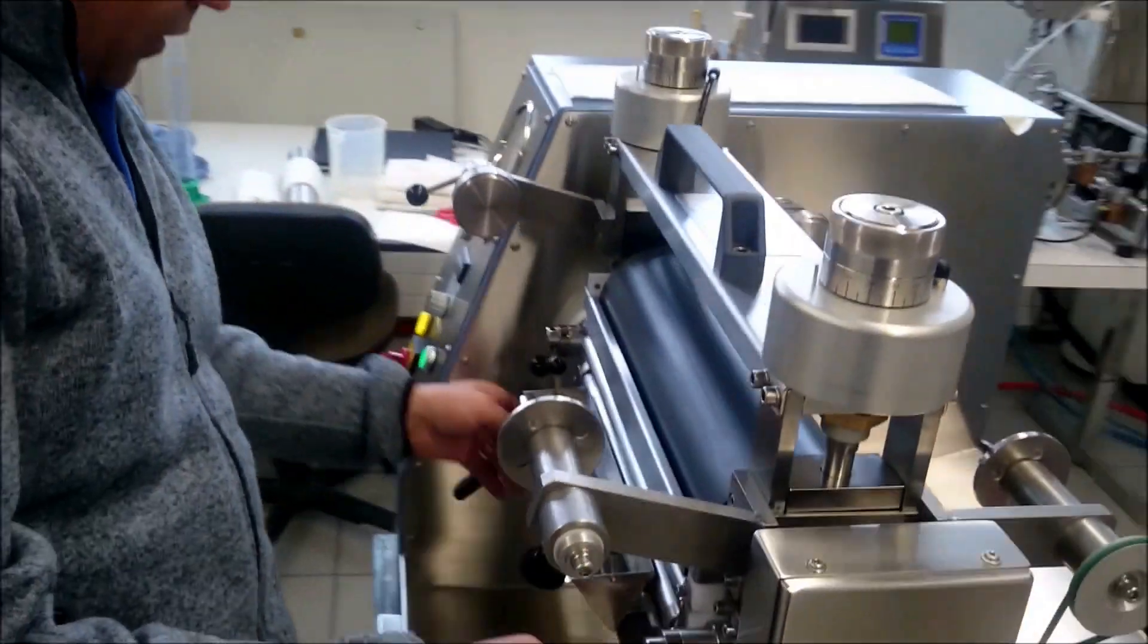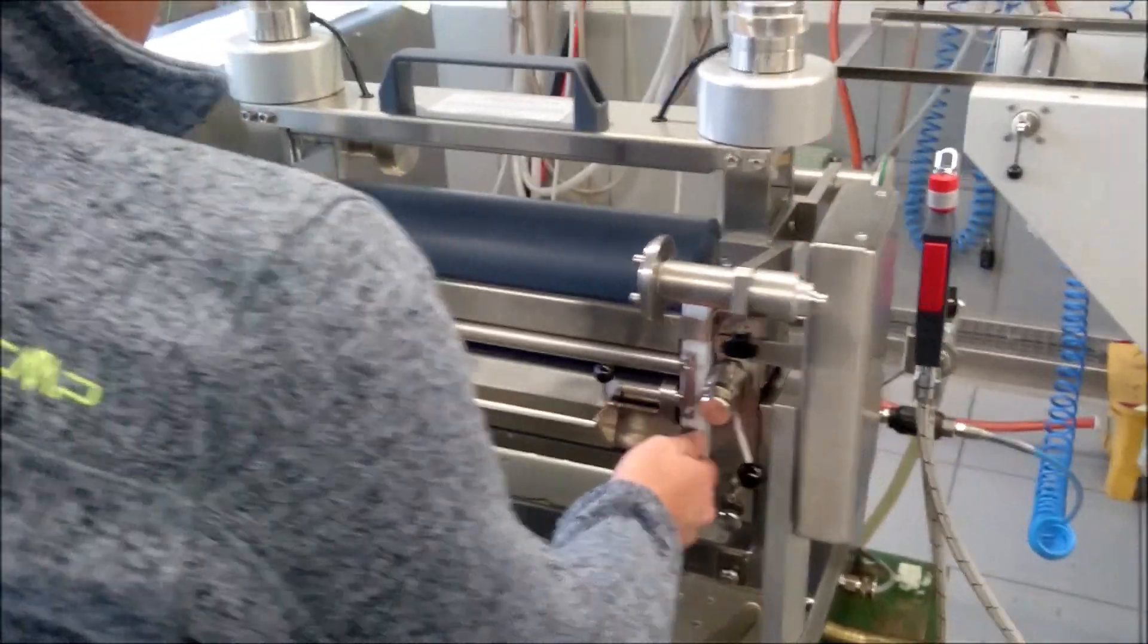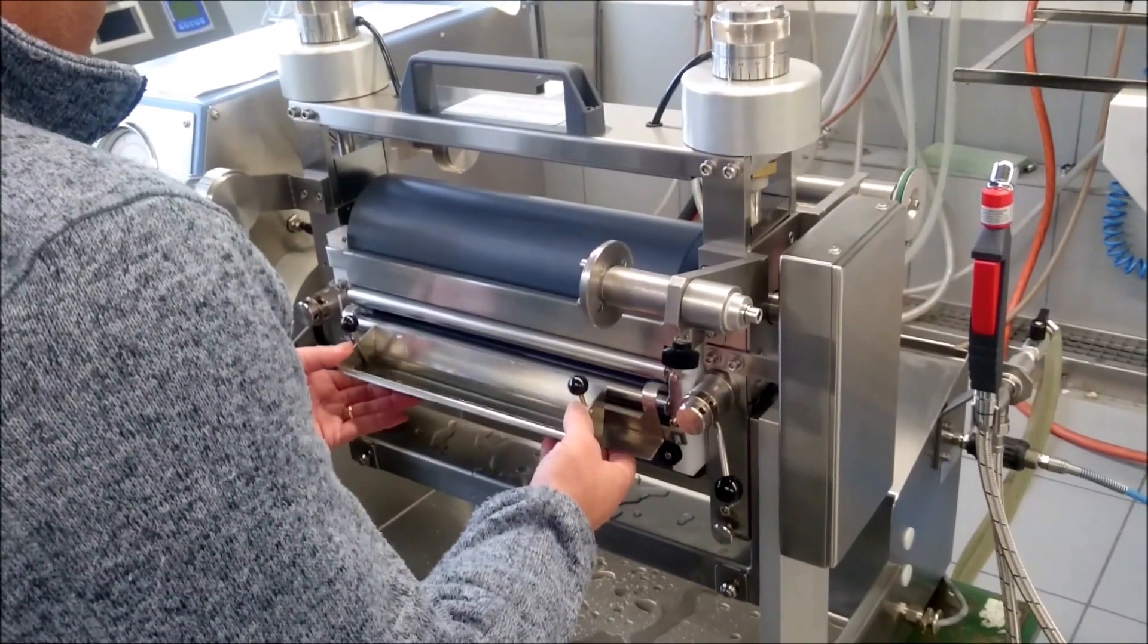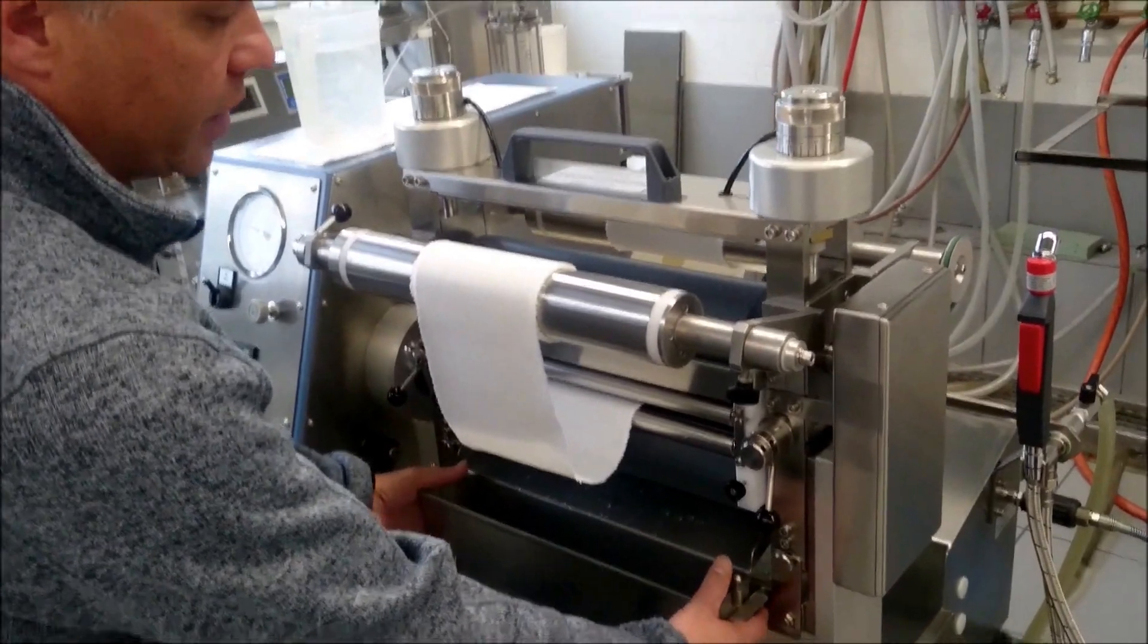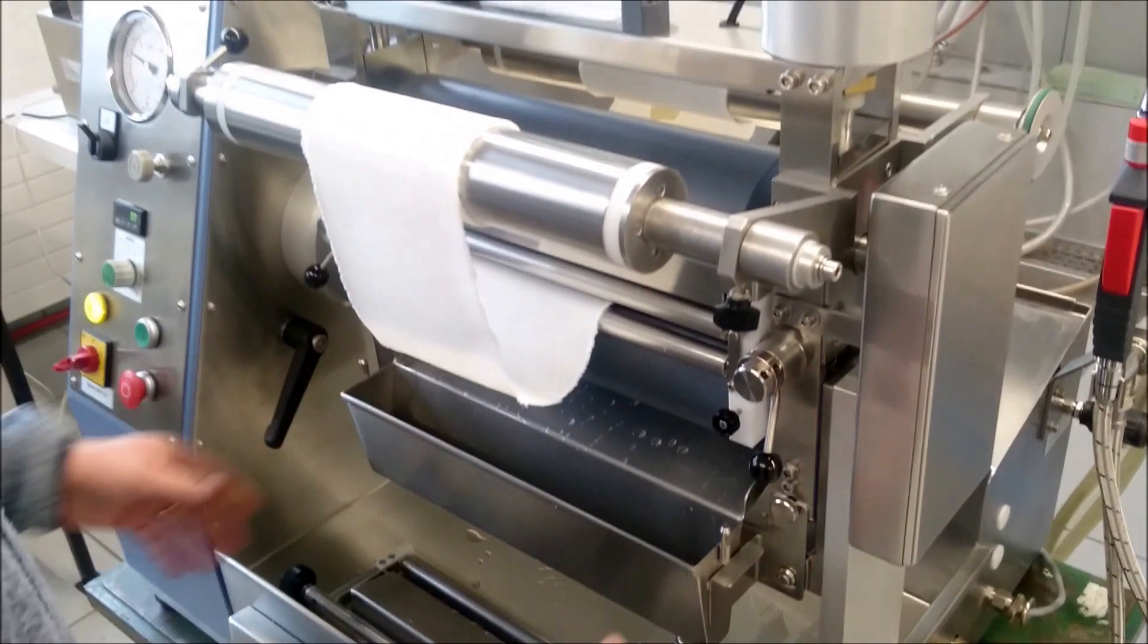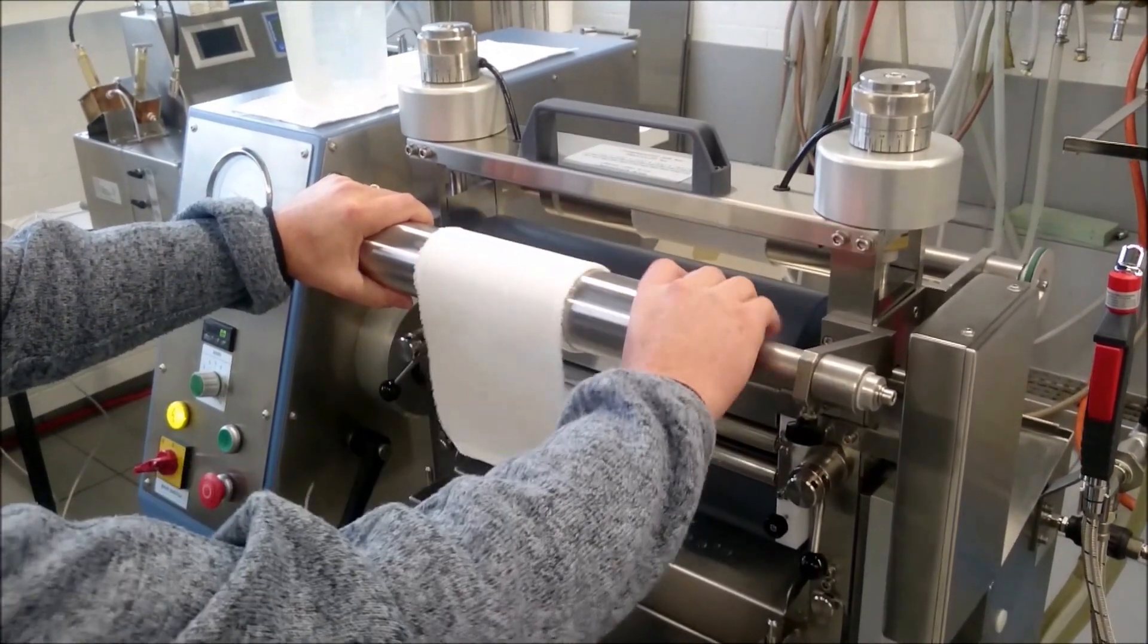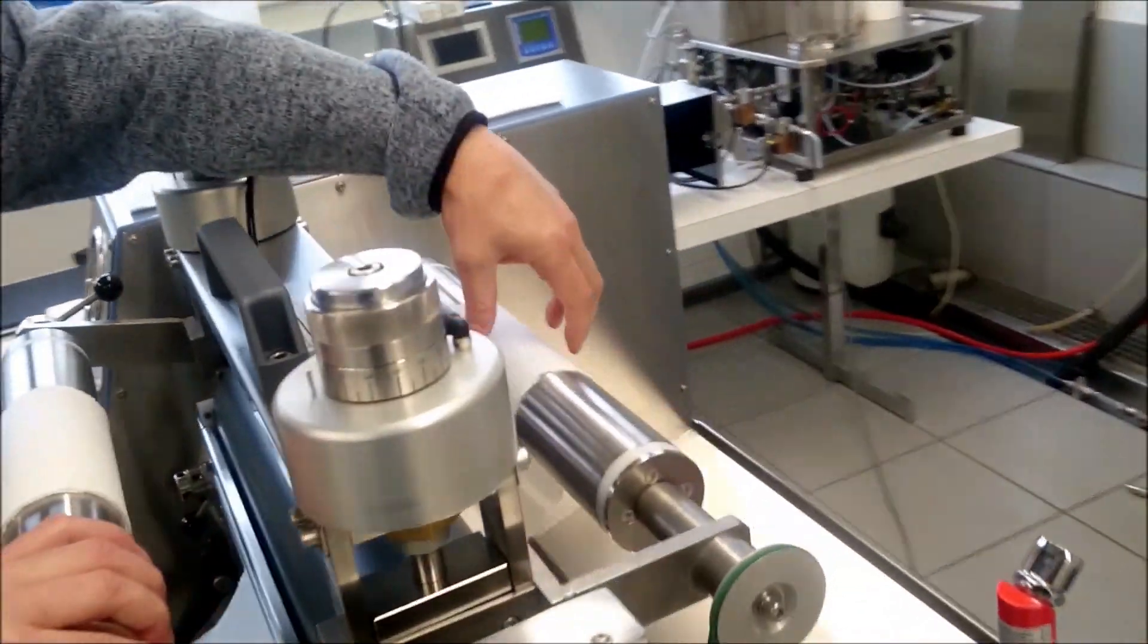Then the third and last possibility to work with our padder is with the larger. It is to work with the one liter troughs in vertical position. It could be one, two, three meters materials on the winder. And we fix it on the back side.